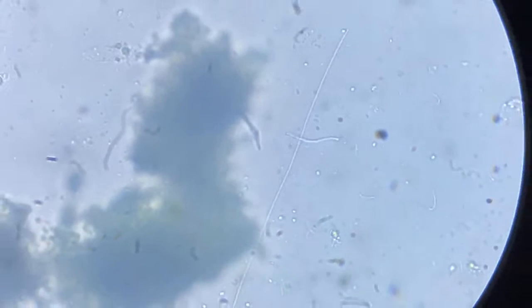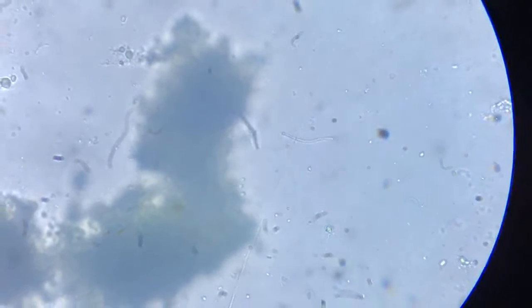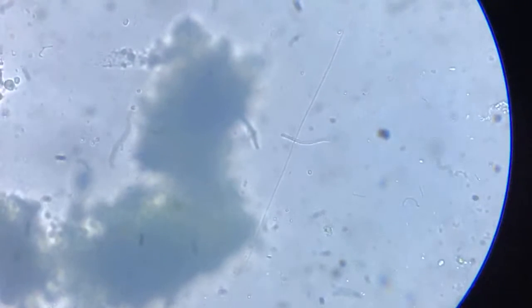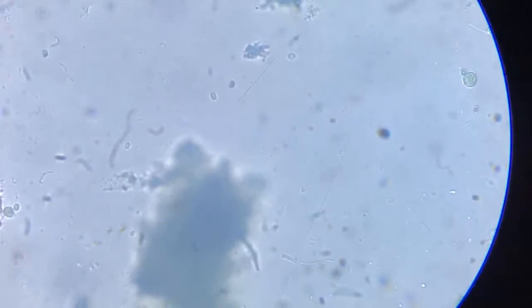And it's very, very thin compared to those hairworms or the threadworms, even the guinea worms. But I presume it could be a larva of the guinea worm or the loa loa. But again, that is just an assumption. There is no surety of it.